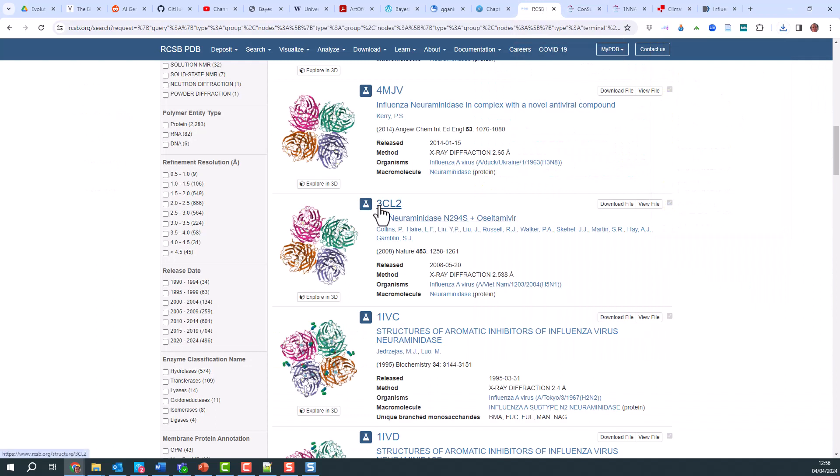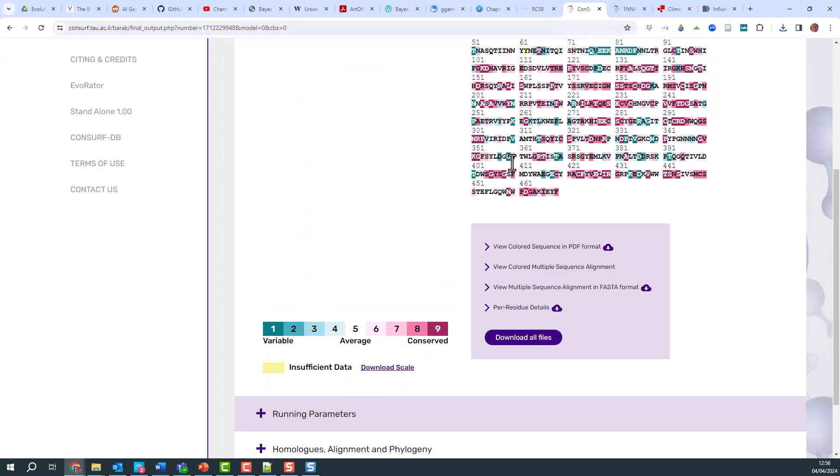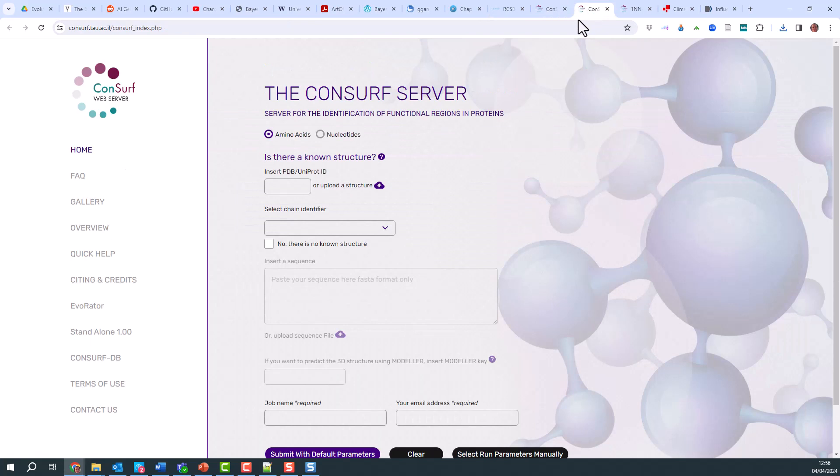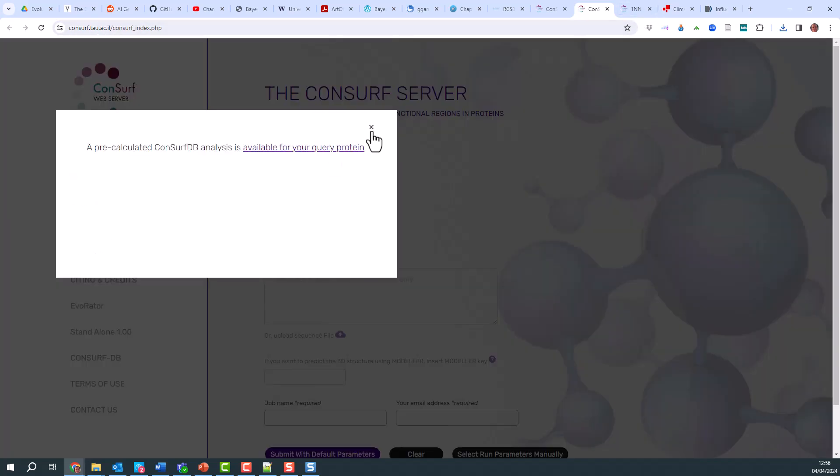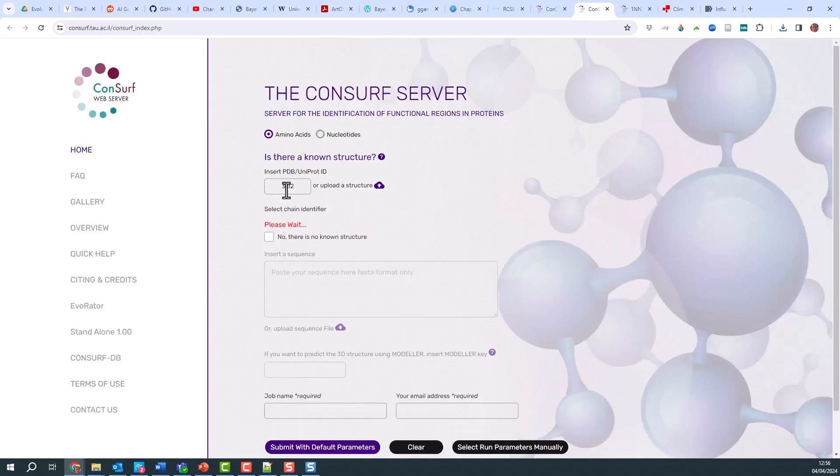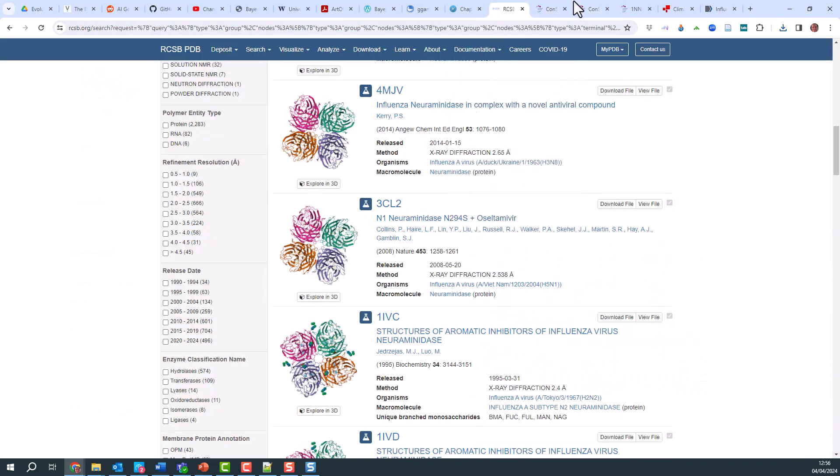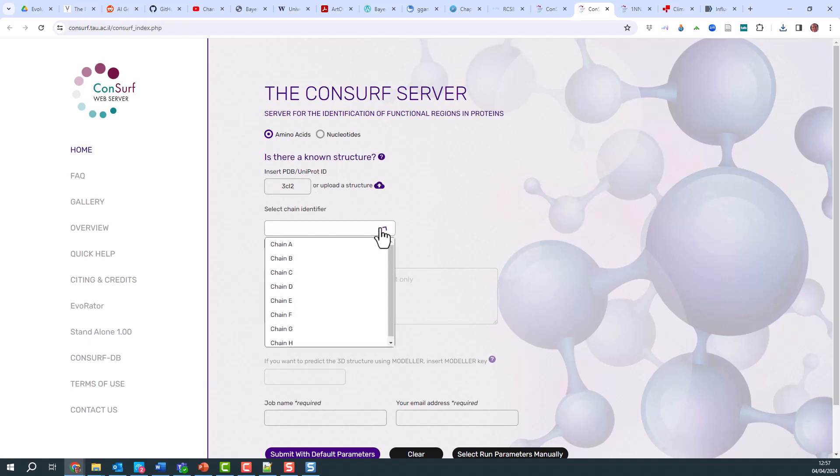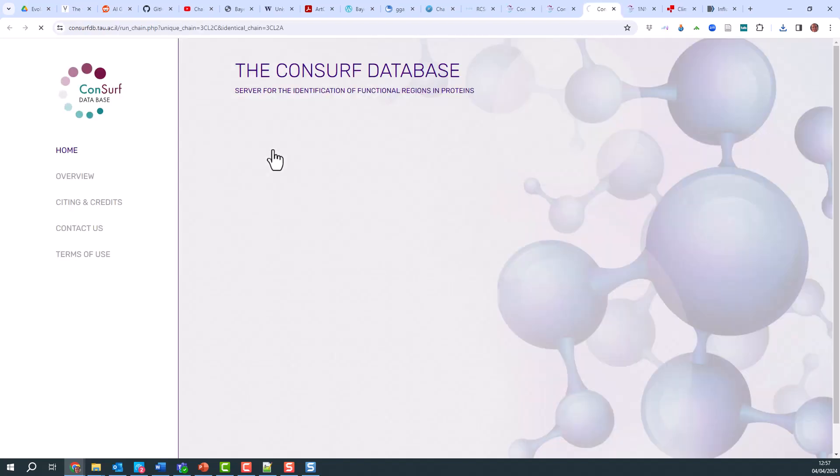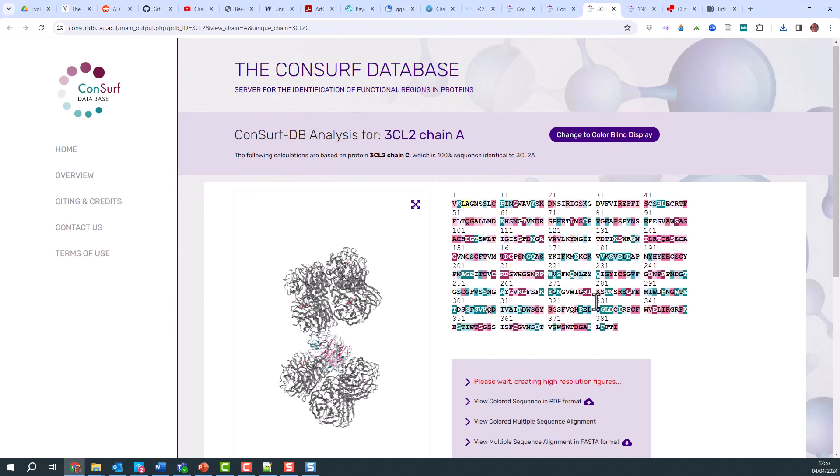Here is an N1 sequence, which is 3CL2. I go to home and open link in a new tab to get a new window, and I can do this one 3CL2. Which chain do I wish to use? I don't think it matters. We'll pick A. There's already a pre-calculated CONSURF because it's already in the database. I can click on that and see what results I get.